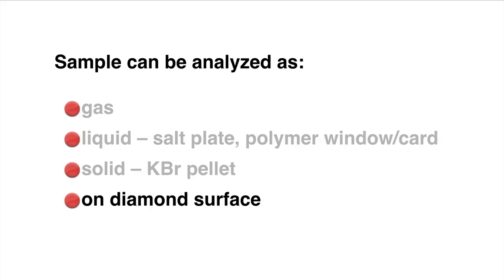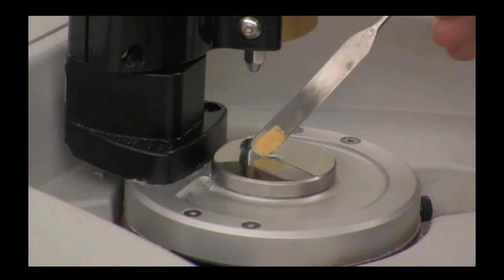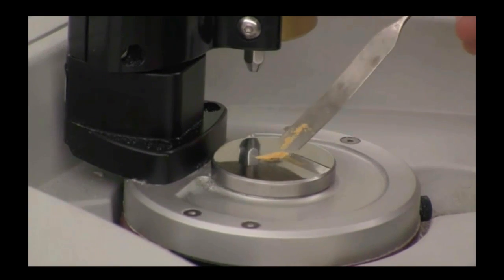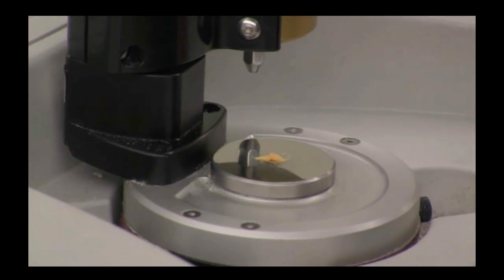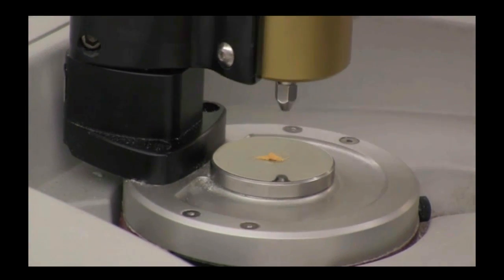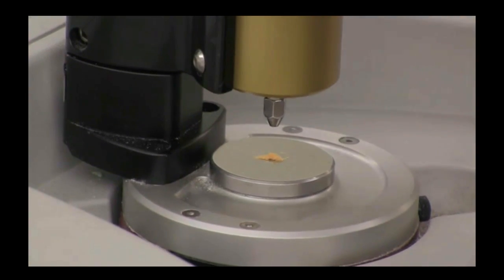Now at Northwestern with the large undergraduate teaching labs we don't press KBr pellets, there's a little bit of an art to it, it is a little bit tricky, so what we do is we collect our samples on a diamond surface. This is known as ATR IR spectroscopy, where the ATR stands for attenuated total reflectance. Basically what happens is, as you can see here on the screen, we're placing some solid sample directly over an opening, and on that opening there's a diamond. Now we're going to lower the anvil onto our sample that's going to press our solid sample up against the diamond.